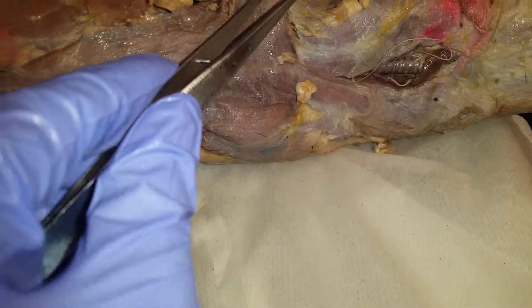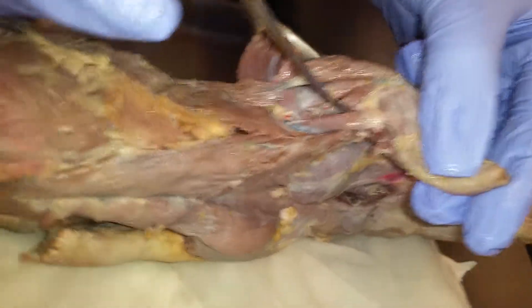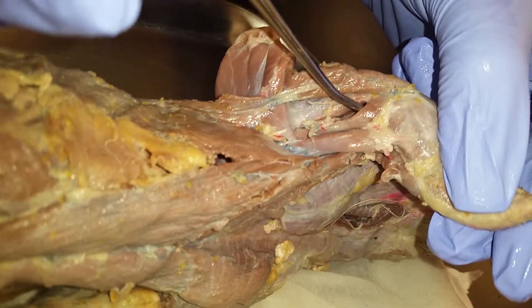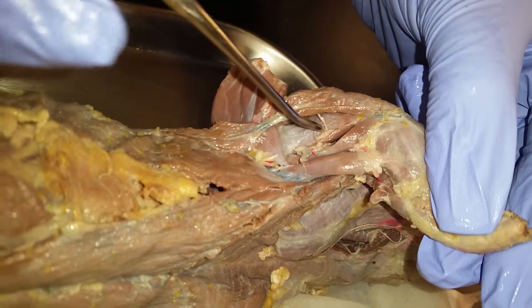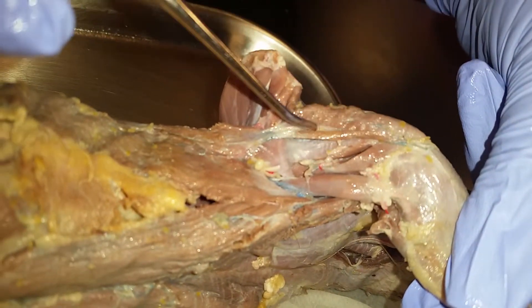Let's do this one right here. That's the clavicular deltoid. Then underneath we have the biceps brachii, the medial head of the triceps brachii, the long head of the triceps brachii, and the dorsal epitrochlearis.